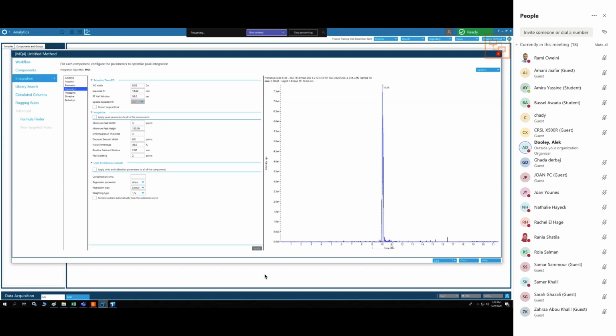So, look at that, we did it. So that is the separation of the isomers, right? Terbutryn is one of the compounds that is the isomer. So we see two peaks. They're not perfectly separated, so this is also a good chance for us to use the peak splitting setting. So this is really excellent, actually.